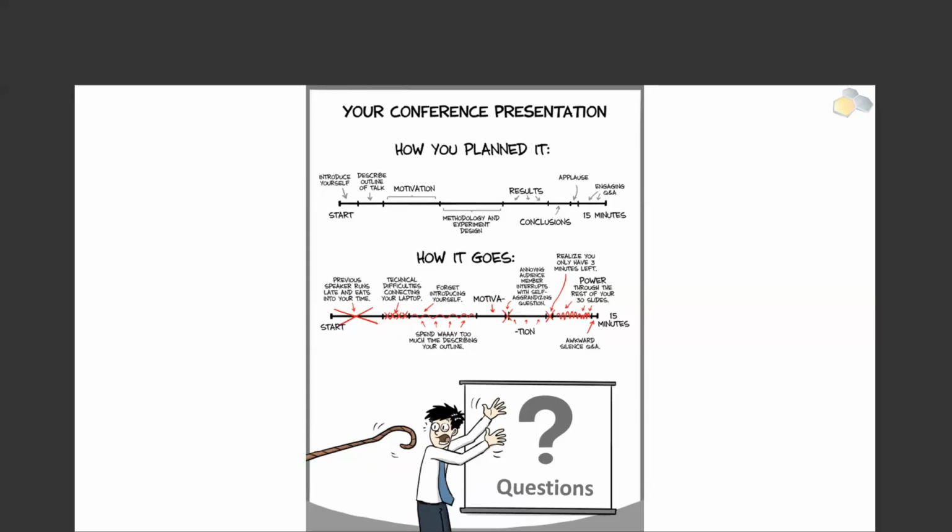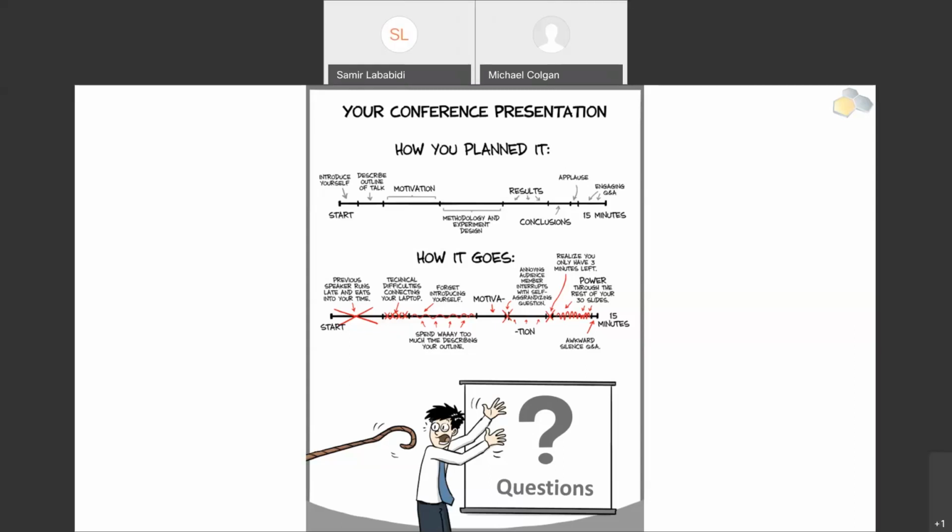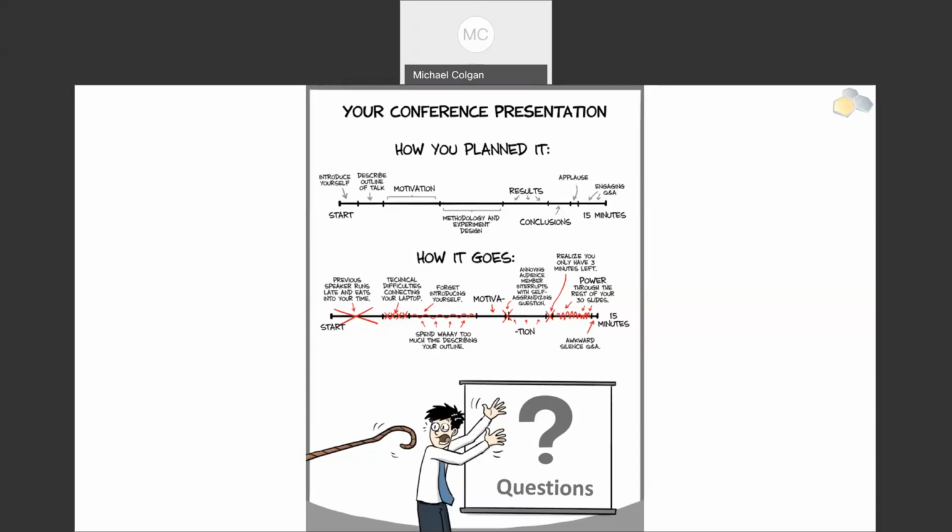There is another question. Let me see. Going to the listed URL for Hive Hexa Hedron for installation instructions at the bottom, it sends you to the Hive page, but the page is not found. Okay, so if you want to install Hive on your own server, there is a GitHub installation that you can download, but it does not have any support. We do not have any funding to provide technical support for Hive installation.